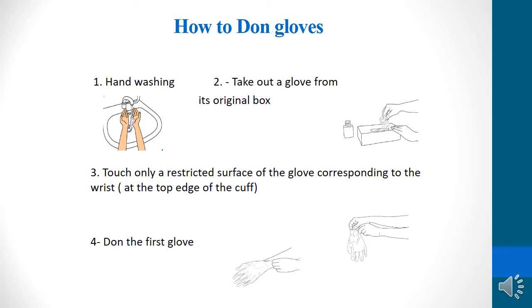What is the procedure for how to wear gloves, or how to don gloves? First, we will do hand washing. Second, take out the gloves from the original box. We have to take the glove directly from the box, not keep the gloves outside on any surface and take from the surface. You should take from the box.